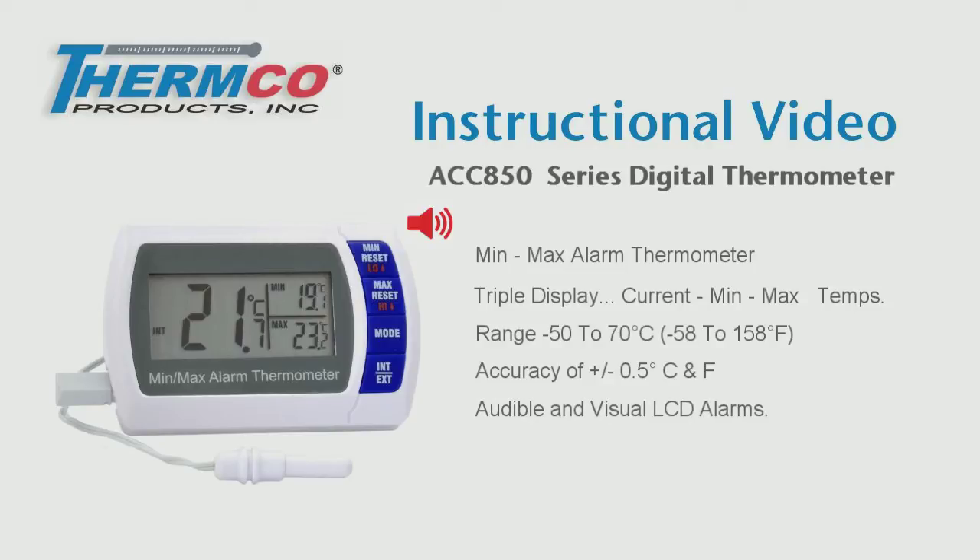This model has audible and visual LCD alarms with programmable low and high alarm set points.